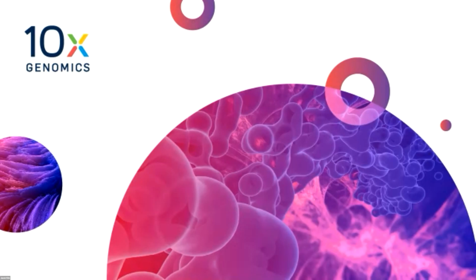I have one more question. This is maybe more relevant to the fresh frozen than the FFPE, but I'm wondering about microbiome infiltration into tissues. Can you detect that by sequencing? That would be difficult. Now I'm going to talk about something that I enjoy, which is out of the box ideas. With the advent of the FFPE solution, it's shown that you can, very similar to single cell, design your own primers going in to potentially target certain things that are not necessarily intended to be targeted. So you potentially could.